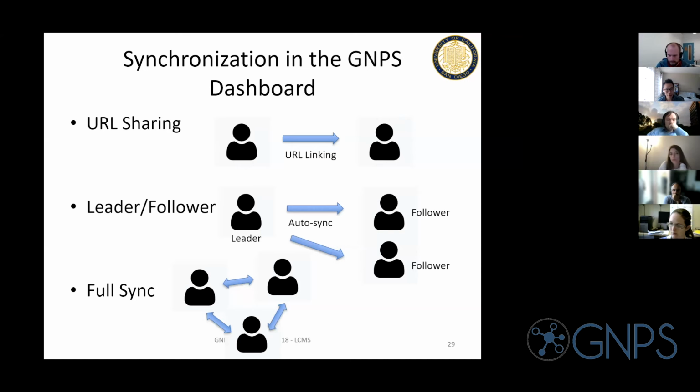So the classic way of sharing it, to me, is you take a screenshot or you do a screen share with somebody else at the same time. And that's great. But one of the things you miss out on is the ability for the other person to take what you've done and build on that particular visualization or explore it in a different fashion. I don't know about you all, but it's frustrating to me sometimes when you're on a video call and you're like, click here. No, click on this button. It's always hard to communicate that effectively, at least virtually. If you're on the same computer, that's a different story, but at least when we're doing this remote collaboration.